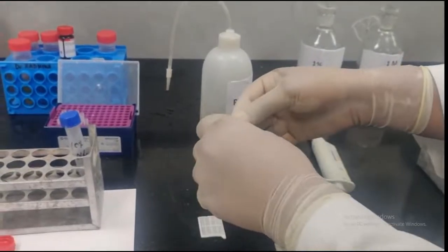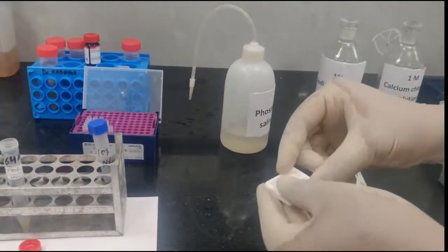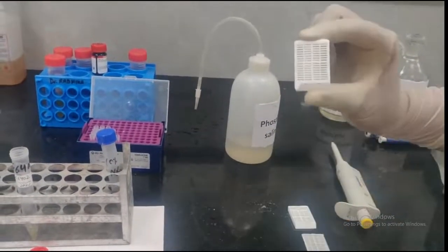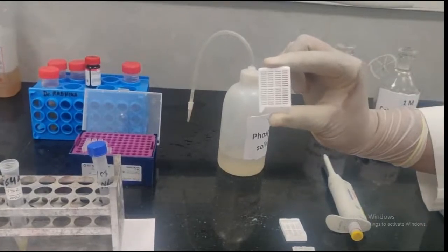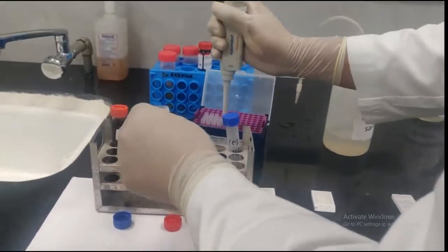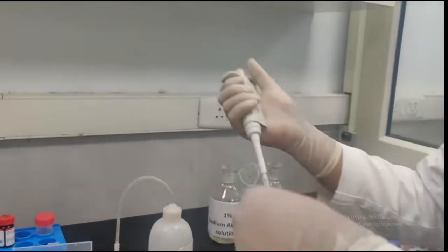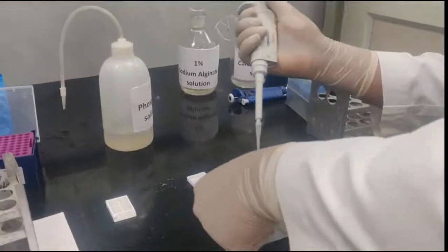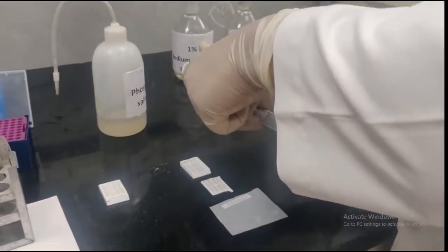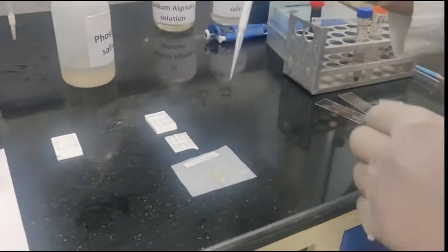This is being put in a plastic tissue cassette, which will then go for tissue processing in the automated tissue processor. The same will be done for the second sample. We'll gently dislodge the clot that has formed at the bottom of the tube. Now this will be put onto the filter paper. You can see a nice clot.